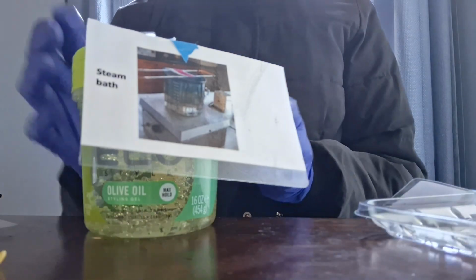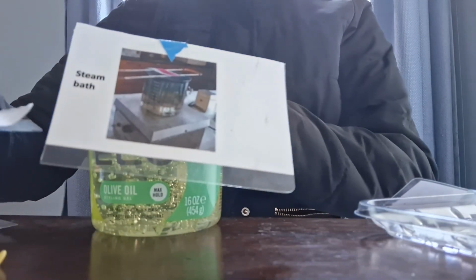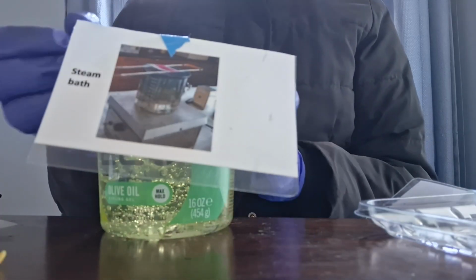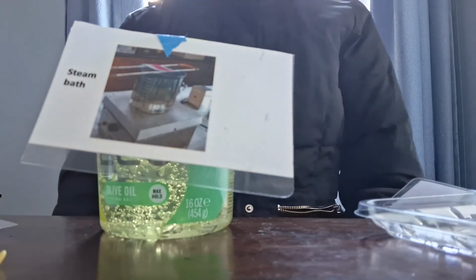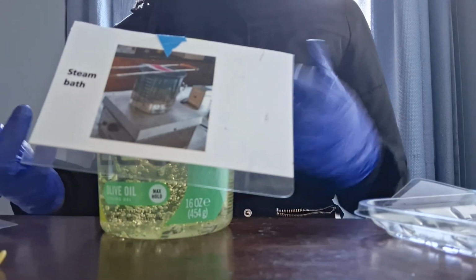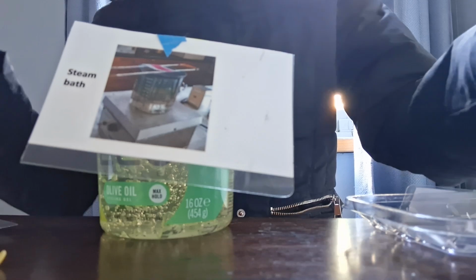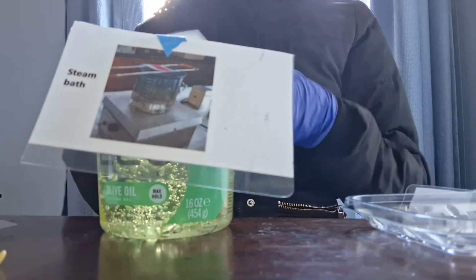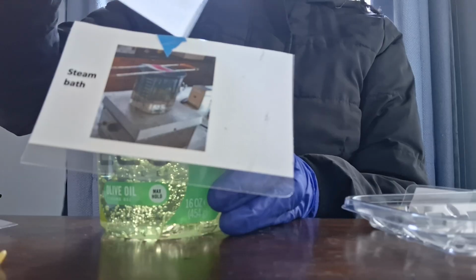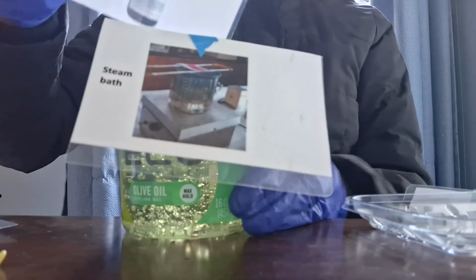So right now I'm going to let it be in the steam bath. As it's in the steam bath, I am going to use the carbol fuchsin. We're going to put the carbol fuchsin in here.